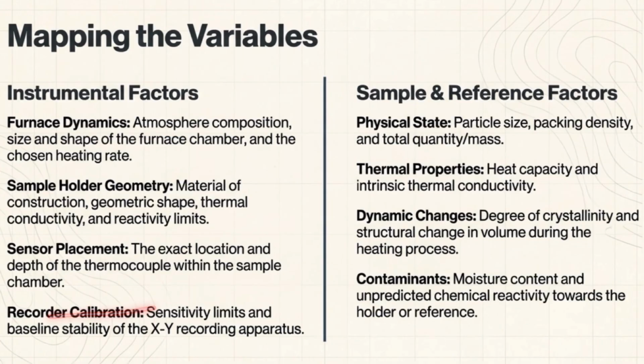Similarly, the recorder calibration. All these factors are related to the instrument, whereas the peak shape also depends upon the sample and reference.